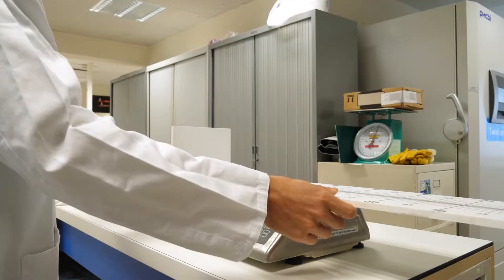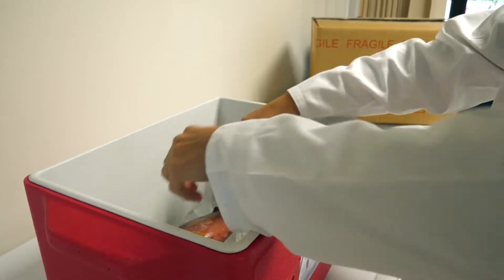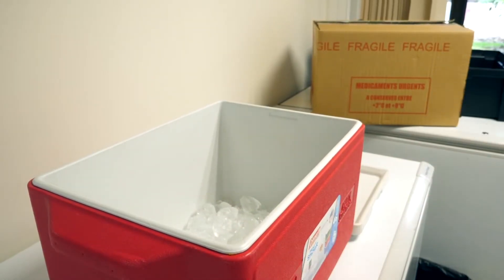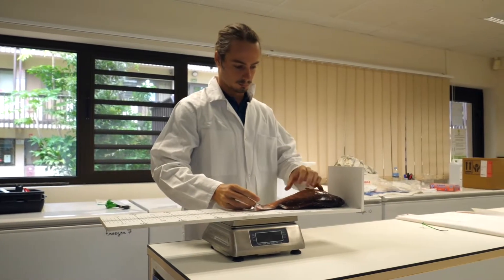Place the measuring board on the scale and calibrate the scale to zero. Take the fish out of the ice chest and remove as much ice as possible that may be stuck to the fish, as it could bias the weight. Place the fish on the measuring board that rests on the scale.